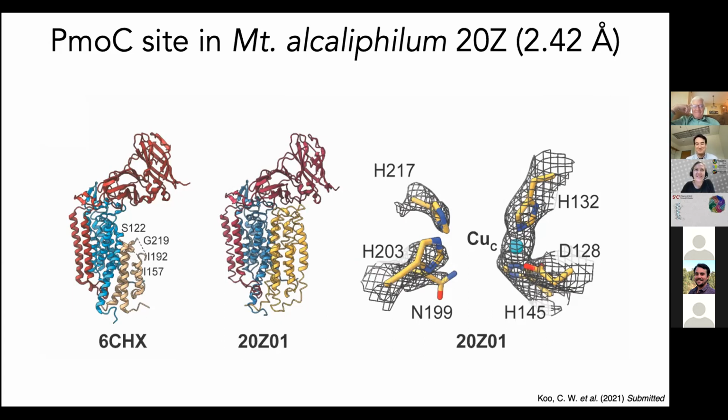Have you considered trying to solve a structure in detergent and seeing if it looks like the crystal structure? I could come up with a million reasons why not to waste your time doing that, but as a thought experiment, would that be worth doing? I guess I was so focused on just getting pMMOs into discs that I didn't do that. I think we've moved past that a little bit, but it would be interesting to see what it would look like with detergent.